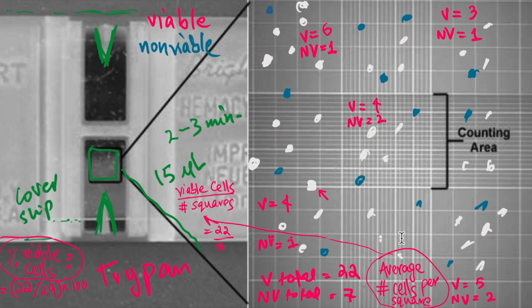The third parameter that we usually care about is the dilution factor, which equals basically the total volume of what has been pipetted into these chambers. It's a ratio with the cell volume, the volume of the cells that was pipetted in. So why is there a difference between total volume and cell volume? Cell volume is the volume of the specimen of the cells that you pipetted in.